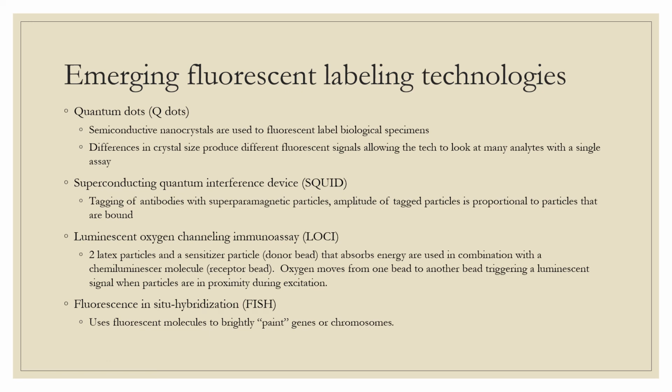We also have luminescent oxygen channeling immunoassays, and then finally we have FISH, or fluorescence in situ hybridization. FISH actually optimizes spectral features of filters to maximize contrast and brightness. It uses highly specific DNA probes to detect genetic markers with fluorescent molecules tagged with fluorescent antibodies. So that's a little bit about the emerging fluorescent labeling techniques: quantum dots, SQUID, LOCI, and FISH.